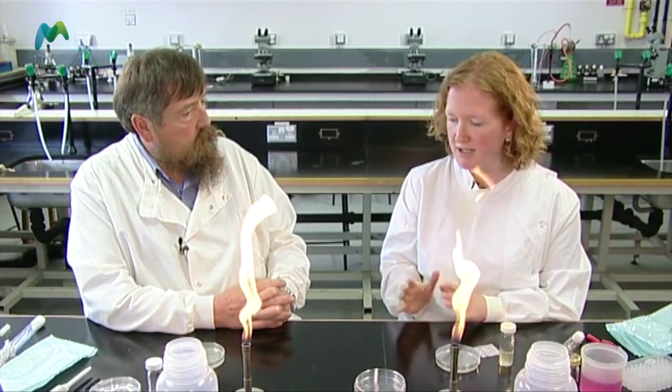So John, our bench is all prepared. We are ready to start our experiment. We've got everything laid out really nicely and we're ready to go.